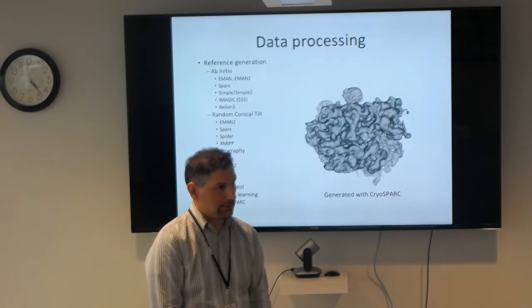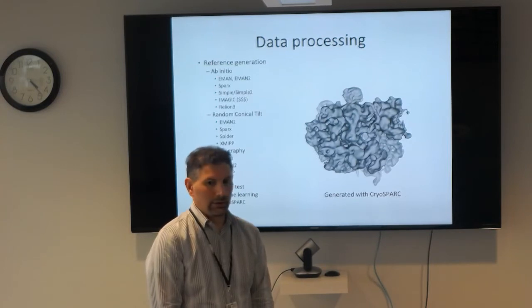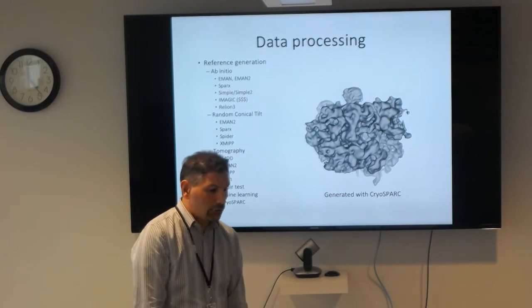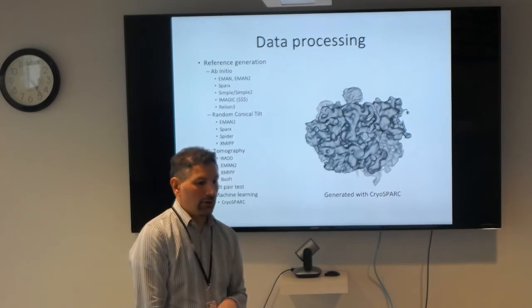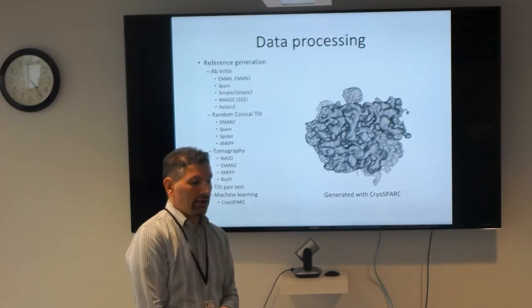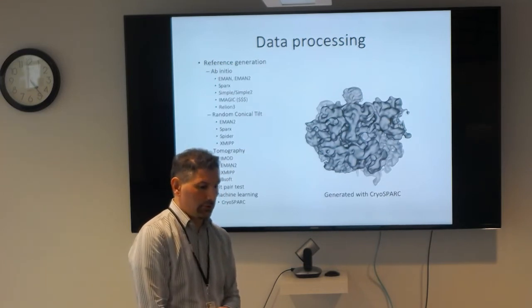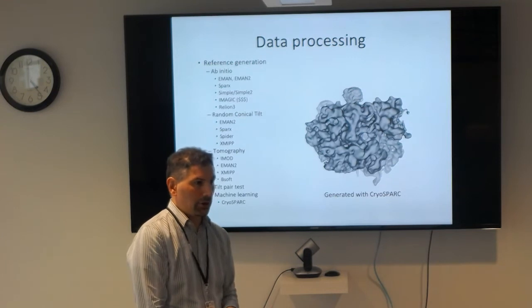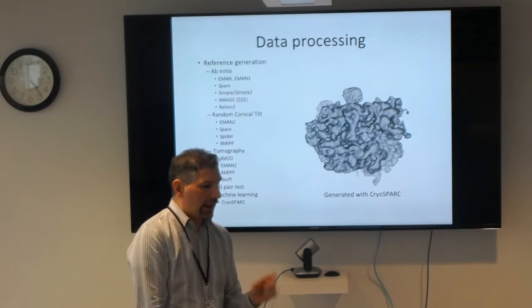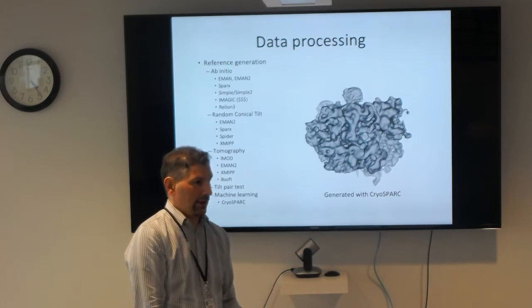Have you ever seen a difference in spikiness depending on different buffer conditions, or signal to noise ratio in the buffer? So I also see spikiness when the signal to noise ratio is low. Like I said, we had a data set where we tried a 225 kilodalton particle on carbon. You could see the particles, but everything came out spiky. And I think it was spiky because it had a low signal to noise ratio.